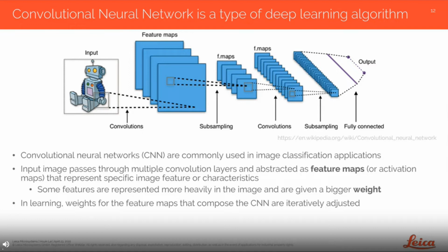These could be some examples of feature maps. These feature maps could also be processed further and subdivided to generate additional feature maps and so forth throughout multiple layers. In each of these layers, all of the information from each of these feature maps connects the input directly to the output. And that's how a convolutional neural network works on principle.